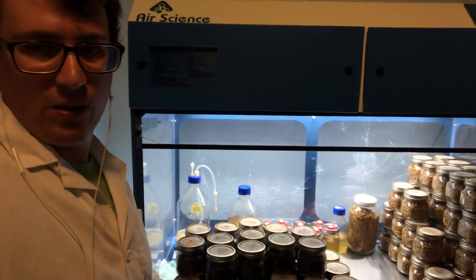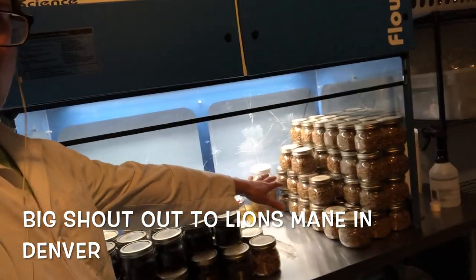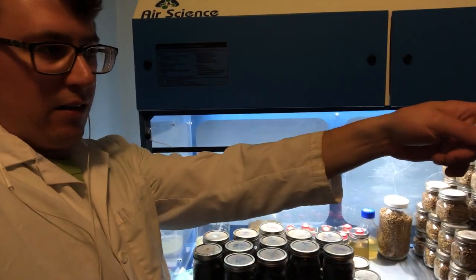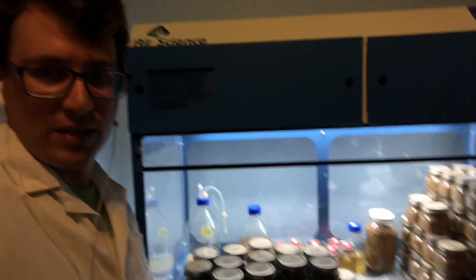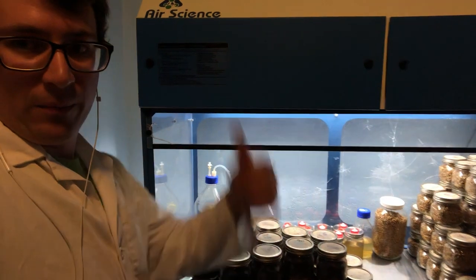So I'm going to go ahead and inoculate the rest of these grains, and I've still got a bunch of the grain growing from our breeding project that I'll be updating on pretty soon. So, much love.